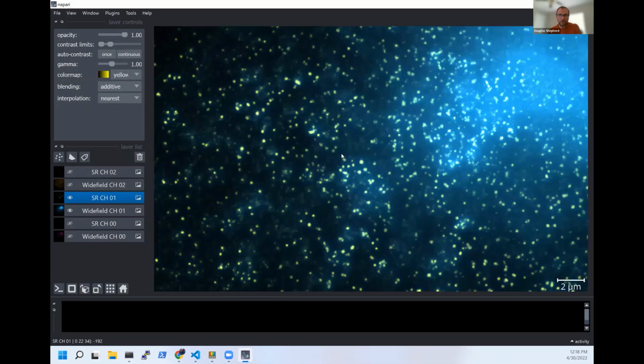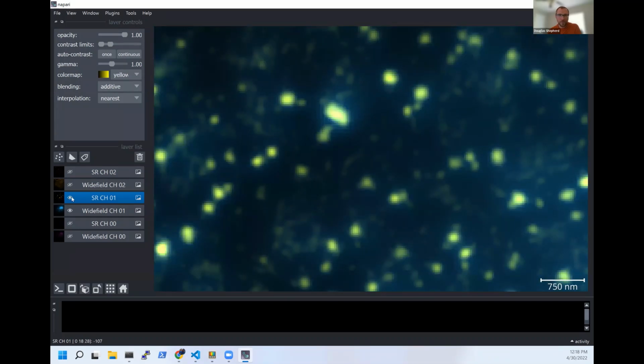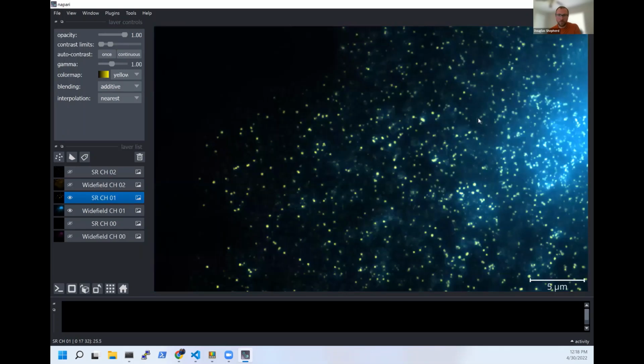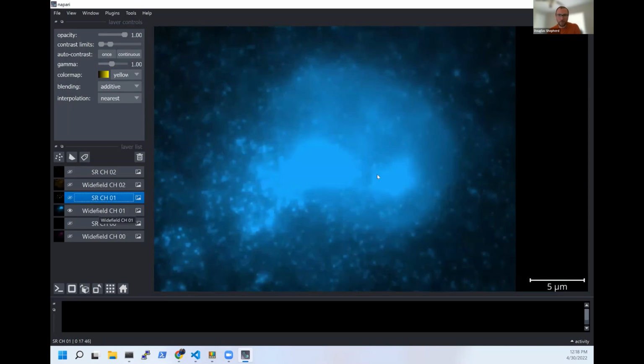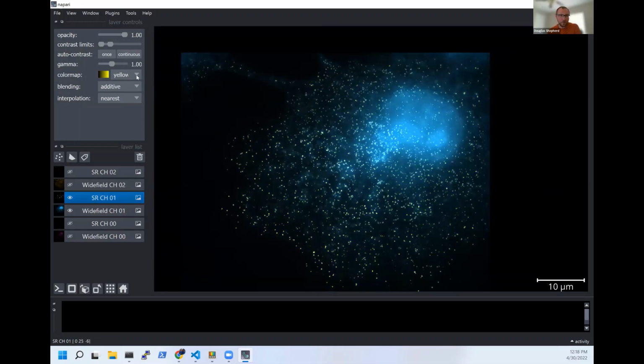So you can see we have very good overlap agreement, a little bit of hammerstroke noise, but not very much. And so here's our diffraction limited image, and then here's our SIM image. You can see we've got some nice improvement in the resolution. Also importantly, we recovered information in the nucleus. If I click here, you can see these very bright areas denoted here. If I bring this back on, we've actually recovered what appear to be Clathrin pits that were masked by that signal.